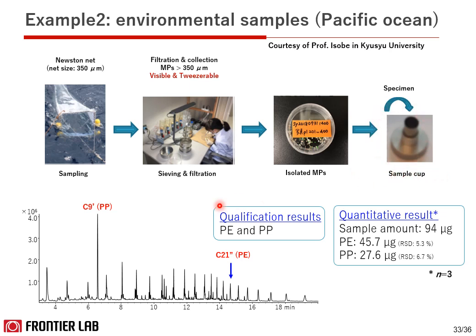As a result, it was found that the main components were polyethylene and polypropylene, and the composition ratio was also found from the quantification values with good reproducibility.